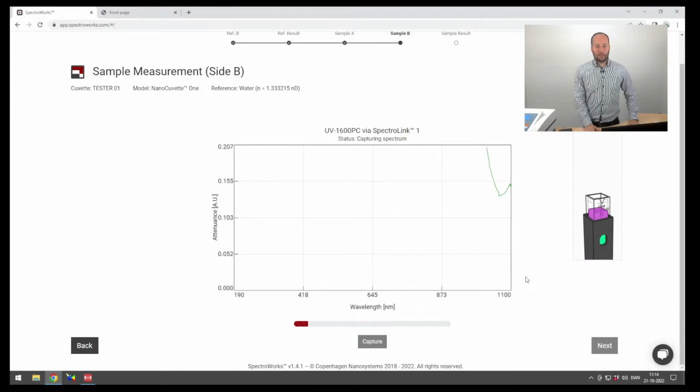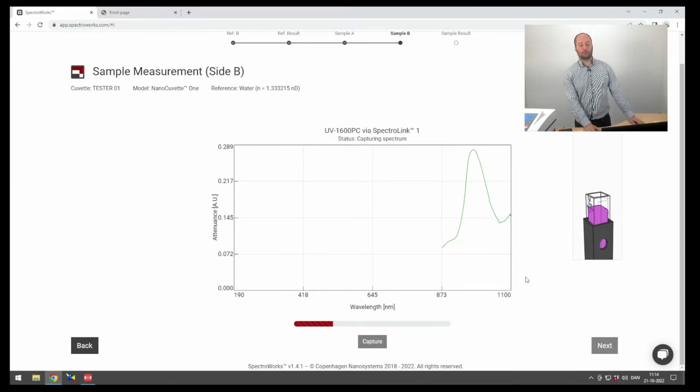When this step is concluded, the software itself will do all of the analysis, and it will also generate a report. Then when we look at the report, we will see if our findings make sense or not, and we can configure the report to our specifications to create a bespoke version that is also generated on all of the dataset. This step saves a lot of time. It instills best practices, meaning we minimize the likelihood of error.